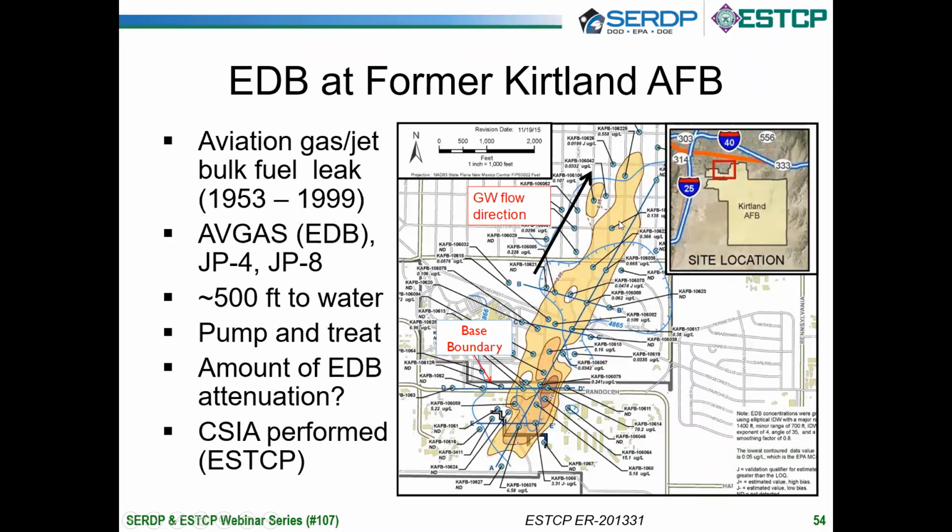It's very, very deep in the ground, but still, of course, it's a concern. There was a lot of question early on about whether this was attenuating and what those rates might be, or whether this is just a plume that's going to go on and on and on. So through ESTCP, through this same project, 201331, methods were developed, and the issue here is you had very low concentrations. We're dealing with 50 parts per trillion.